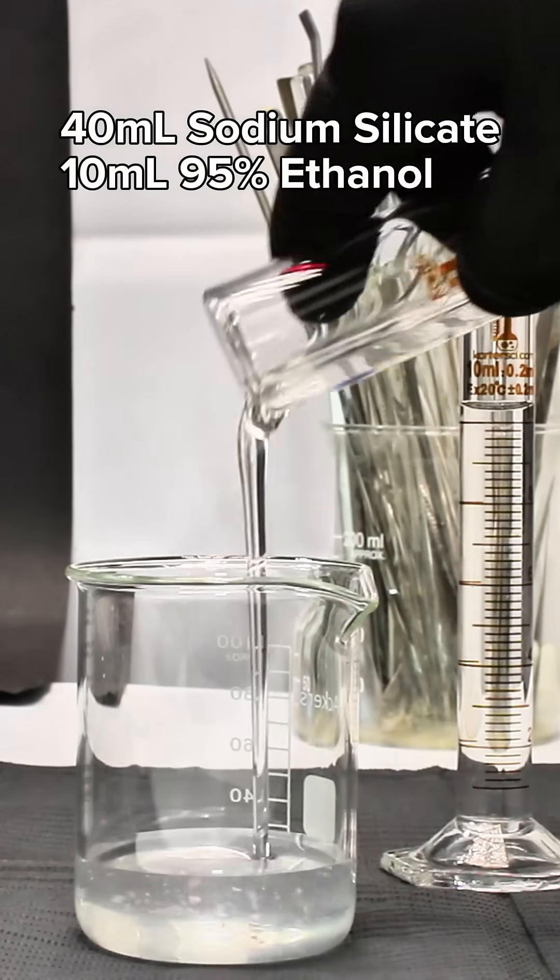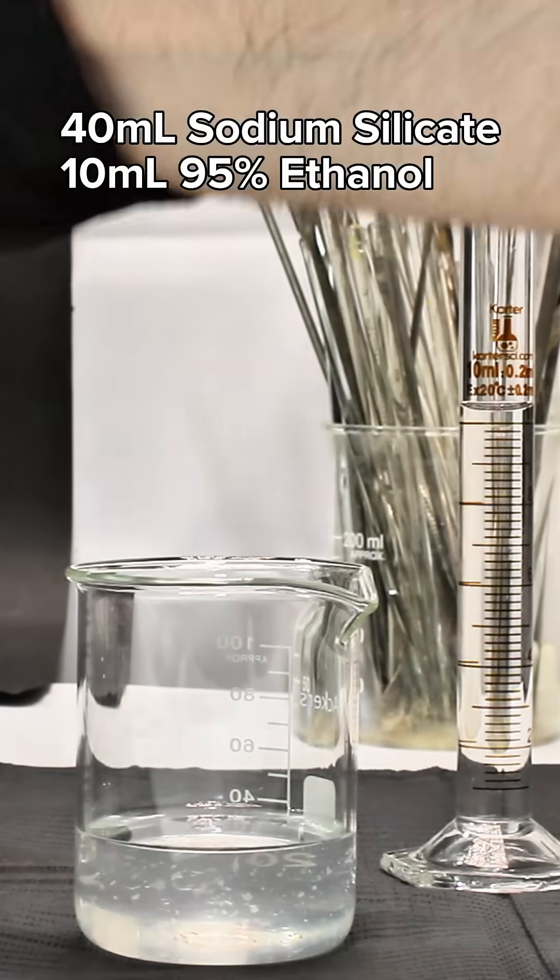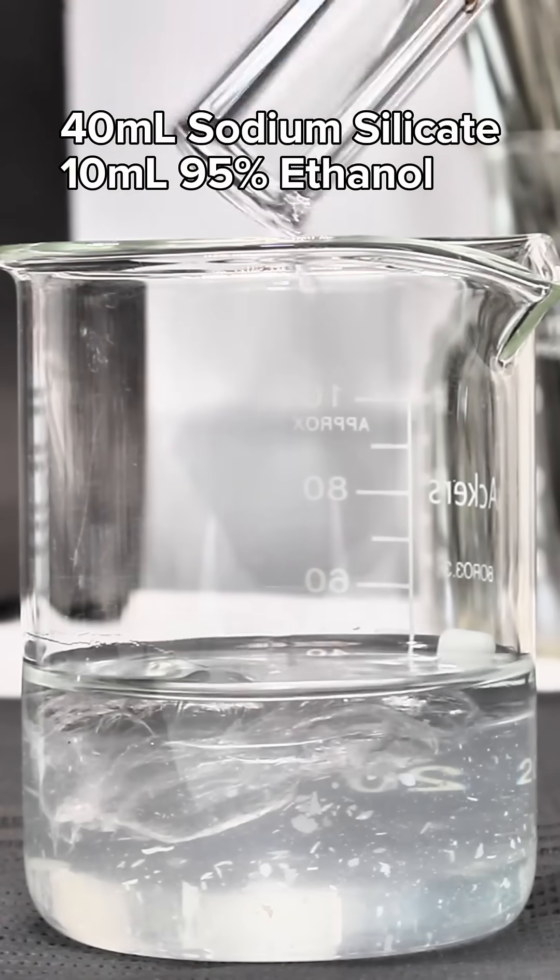To get started, I simply measured out 40 milliliters of sodium silicate and 10 milliliters of 95% ethanol. I got this sodium silicate from the hardware store, but you can also make it by dissolving sand and sodium hydroxide.